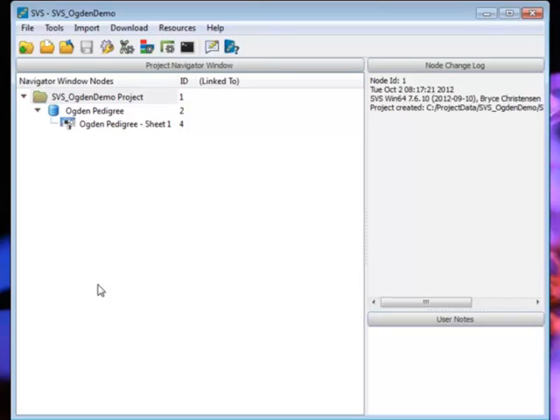We'll start by importing raw data from VCF files. We'll proceed to identify variants on the X chromosome that follow an X-linked pattern. We'll reduce that to the ones that are high-quality, non-synonymous variants, then annotate them and see if there are any clear and obvious candidates for causing the disease that come to the top. Does that sound like a logical workflow? Okay, good.